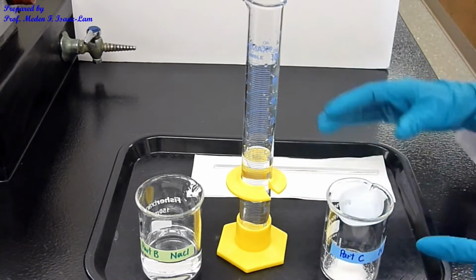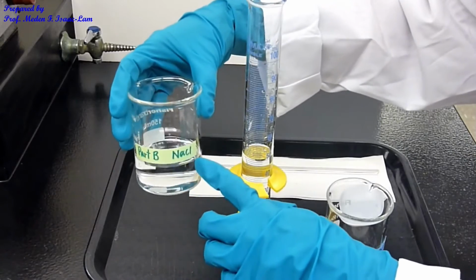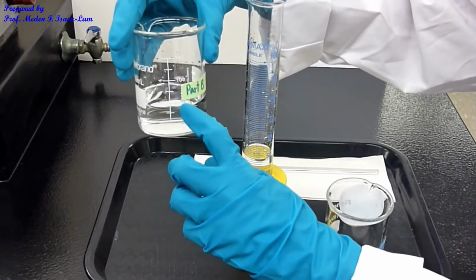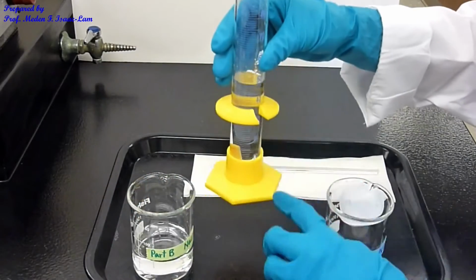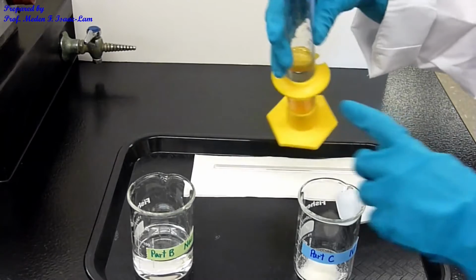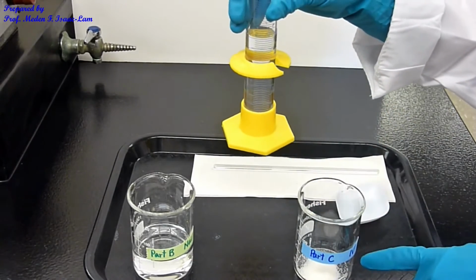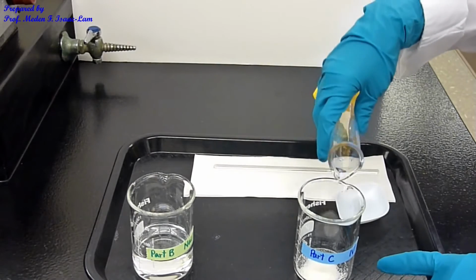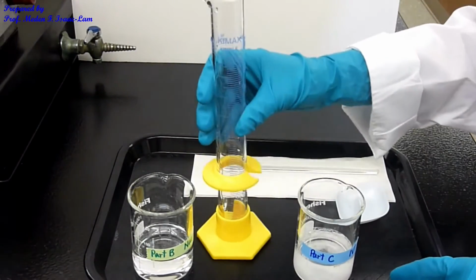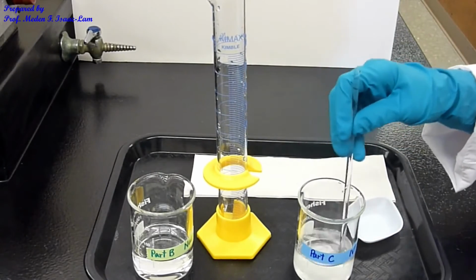All right, so just the dextrose, and then I took 50 ml of that part B solution. So it was 100 ml before. So you can see 100 ml. So I took out 50 ml. I measured 50 ml using the graduated cylinder, and again I'm going to dissolve it. So remember, this is NaCl, this is saline solution, and then however we're gonna mix one more solute, which is the glucose or dextrose. So the same thing, I'm gonna pour it, and then I'm gonna stir it again using a stirring rod, and it should dissolve.